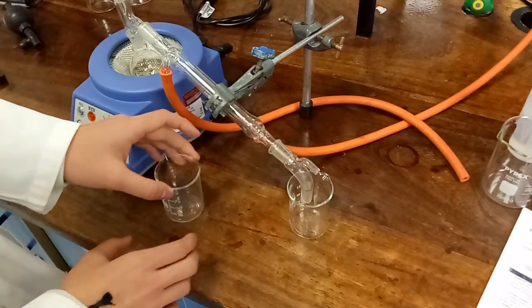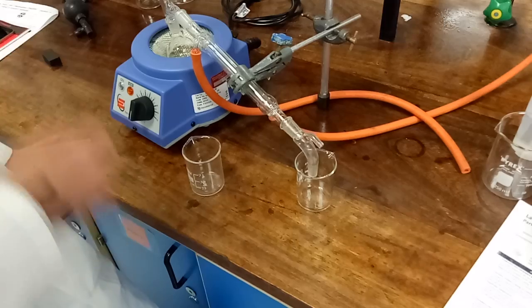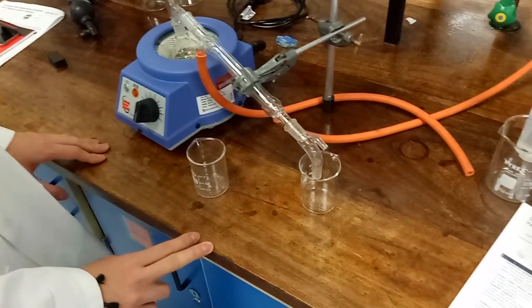We put the first flask to the side to allow it to cool to room temperature and then start collecting the second fraction.